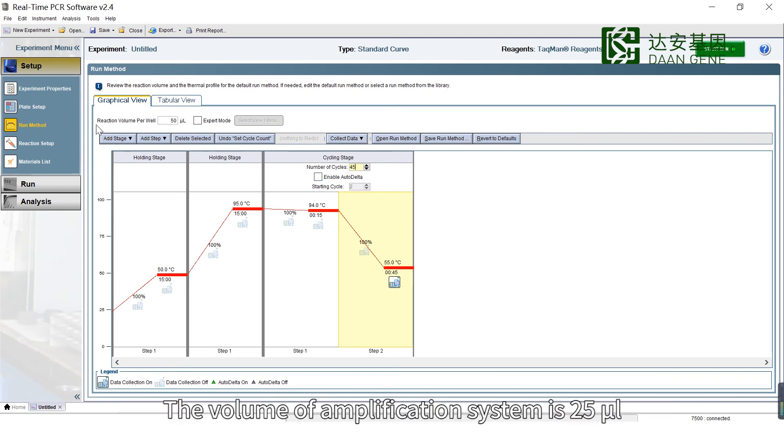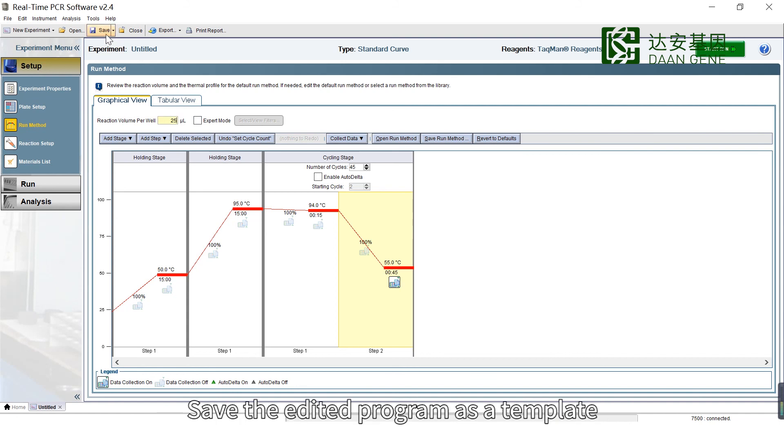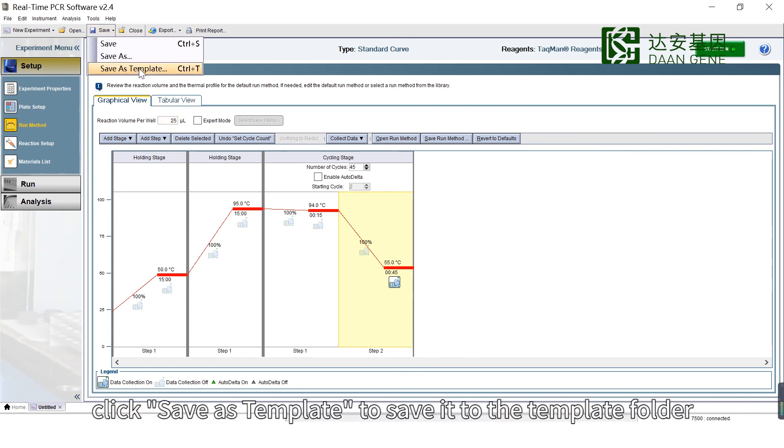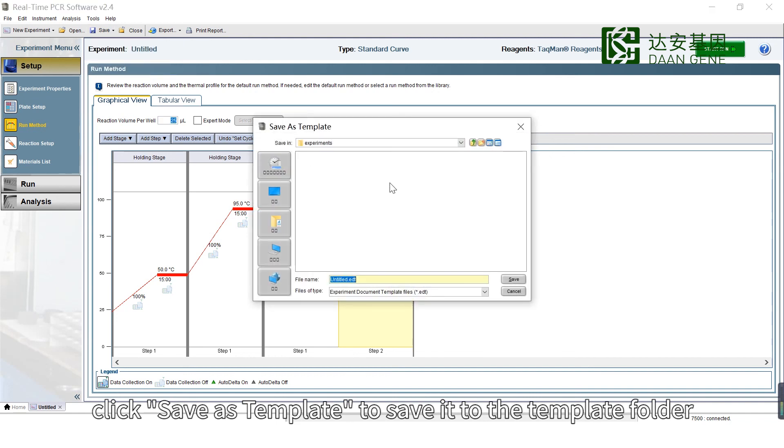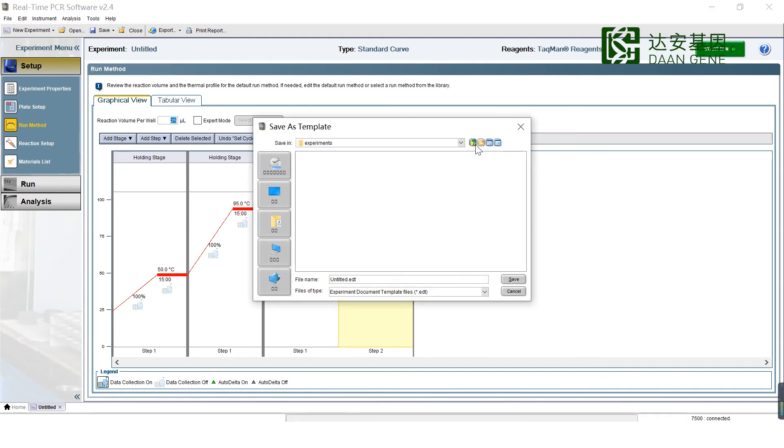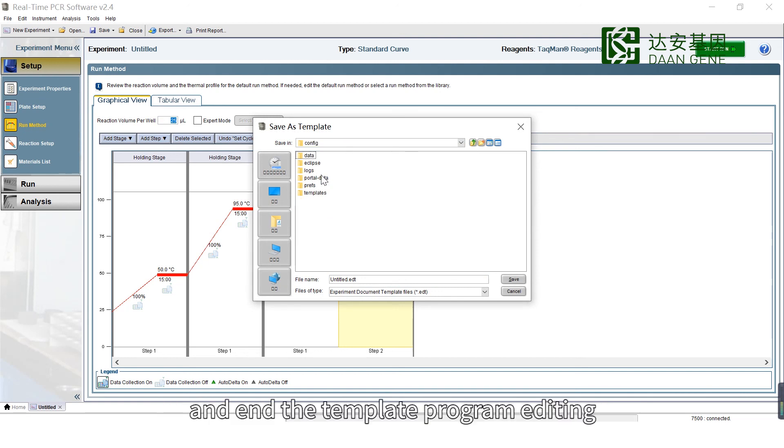The volume of the amplification system is 25 microliters. Complete the amplification program editing. Save the edited program as a template by clicking Save as Template, save it to the template folder under the installation directory, rename it, and end the template program editing.